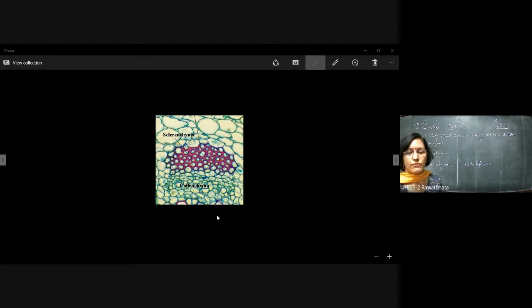It clears the confusion that here lies collenchyma, wherein there is thickening. Here it is very clear where I have kept the cursor. Well, anyways, in this particular area lies the collenchyma, wherein the thickening is there at the end of the cells, and sclerenchyma is quite clear, ultra clear in the particular gap. This one holds the sclerenchyma in the slide.